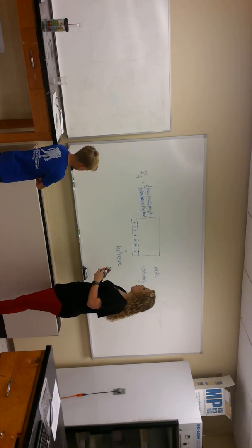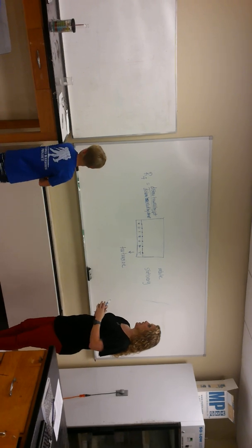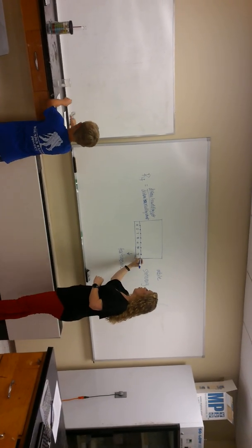So what we do when we get our dye, our solution that we're going to use, and we're going to talk about how we're going to get that off of the M&Ms, but we're going to spot these.